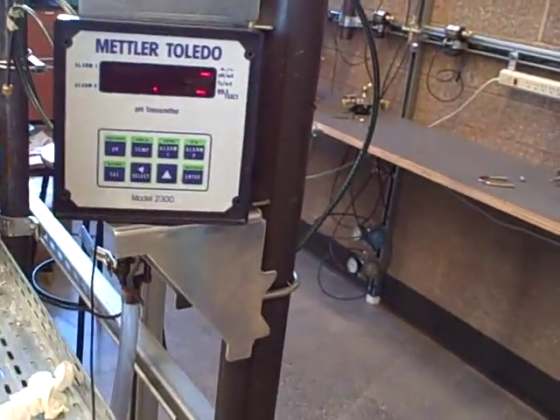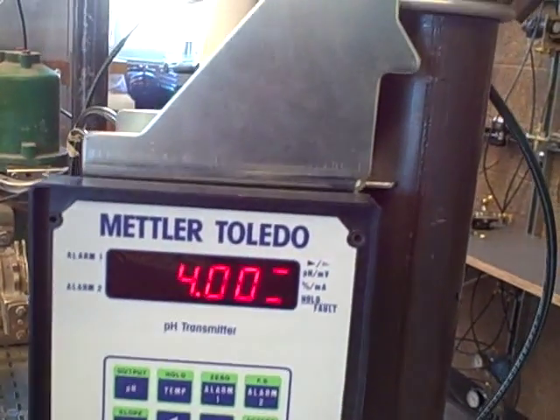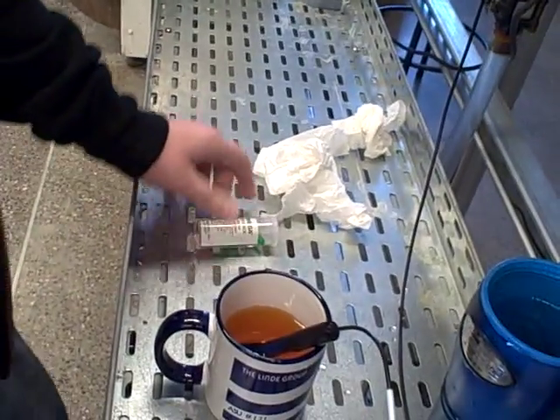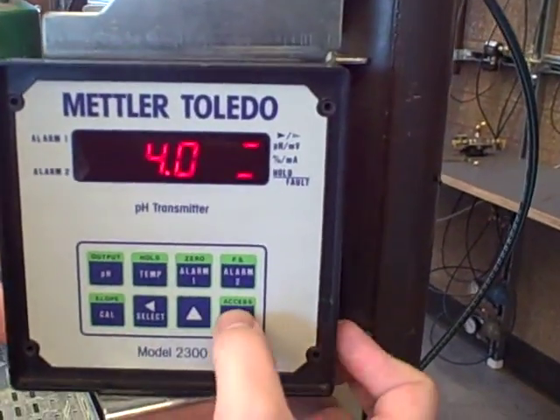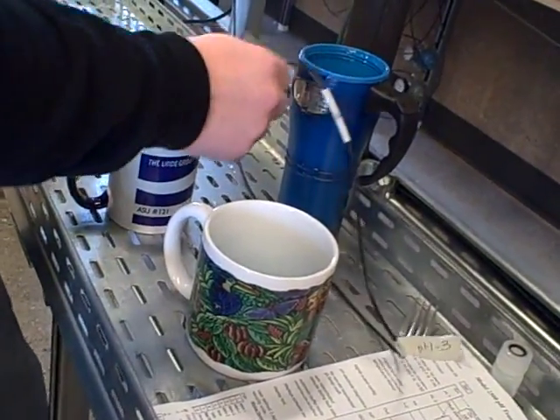Once I have it in there, I push the cal key once to tell it what pH this is. I know from these Omega buffer capsules this is supposed to be a pH of 4, and from that information I will calibrate it to that. So I'll enter a 4 here and push enter. It's now calculated my first buffer zone.